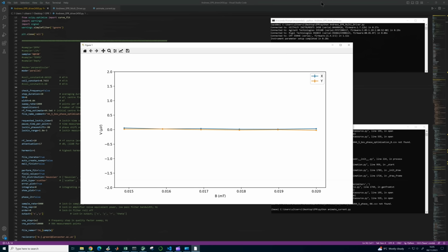So what you're looking at here is a sweep of the magnetic field, and what's happening is our power supply is adjusting the power to our Helmholtz coils, which is changing the intensity of our field B0. And that is starting at 20 microtesla, sweeping down through zero magnetic field, and eventually concluding at minus 20 microtesla. Now the minus here refers to the direction of B0, and that switches on the z-axis.